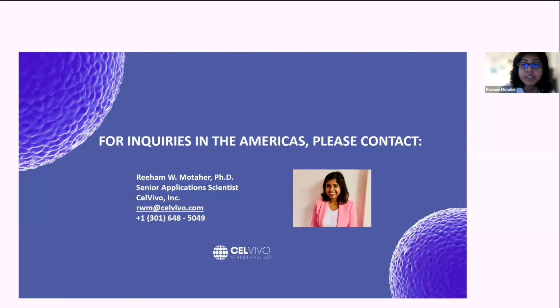Another question: how difficult is it to lyse these cells when performing molecular biology techniques such as PCR? How many cells are in one spheroid? That's a nice question. We have published a protocol where we show how to do the enzymatic digestion of the 3D constructs.